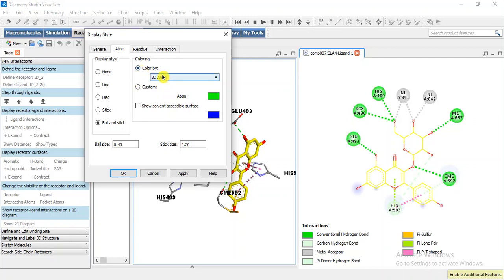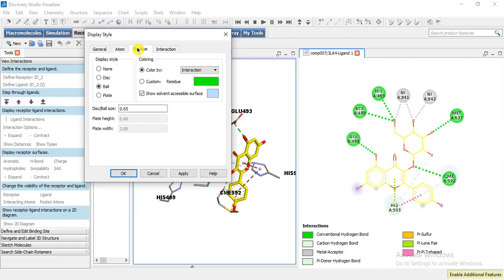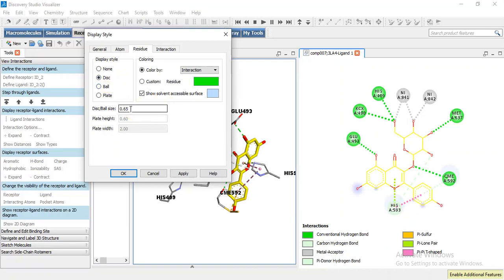For residue I am going to make it disc. It is like ball model and I am going to show it in this model and I am going to increase the size to 0.9. Here I am going to remove this.